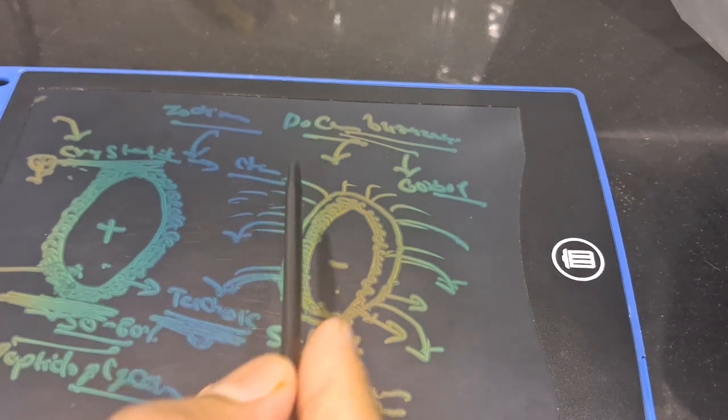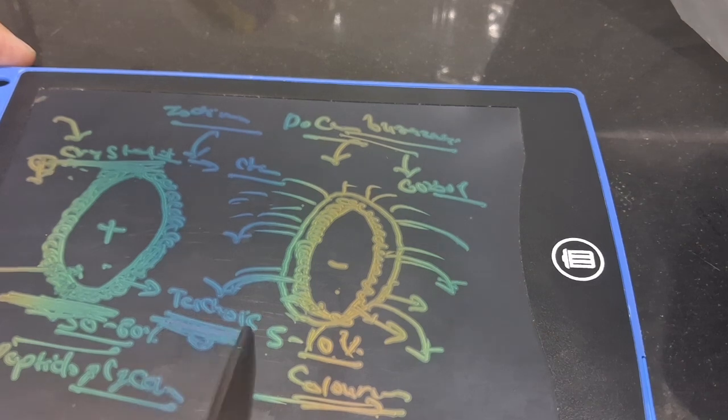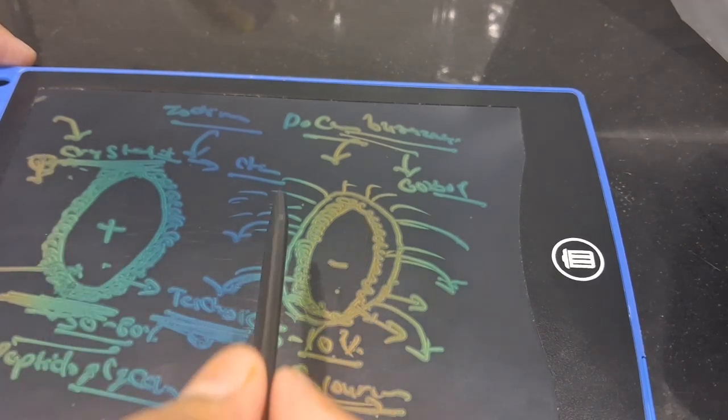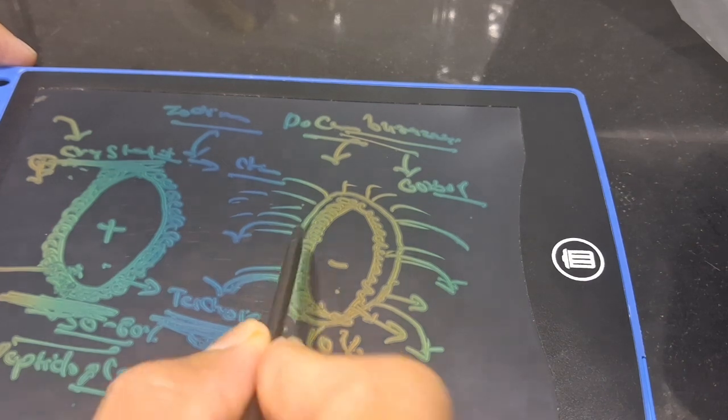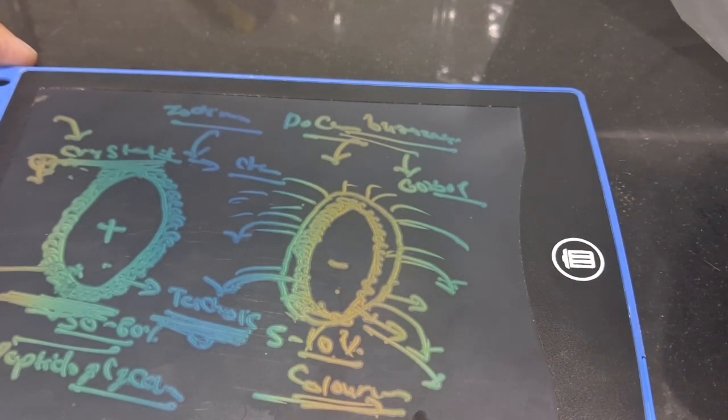So as you apply the counterstain like carbol fuchsin, the negatively charged polymer will combine with the carbol fuchsin and give the color of pink to red to the cell wall of gram negative bacteria. But in gram positive, they are still looking purple.